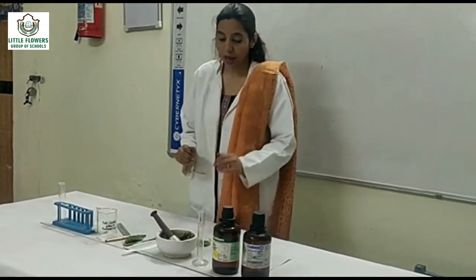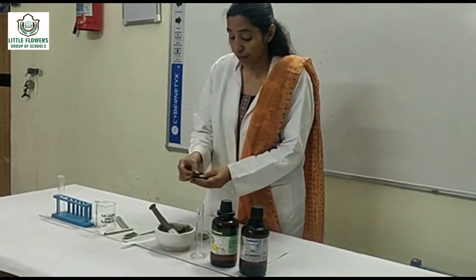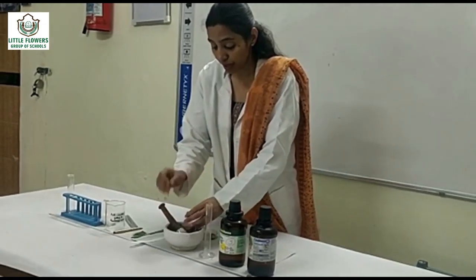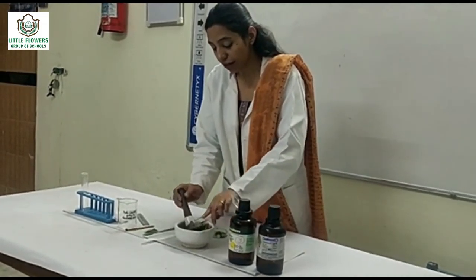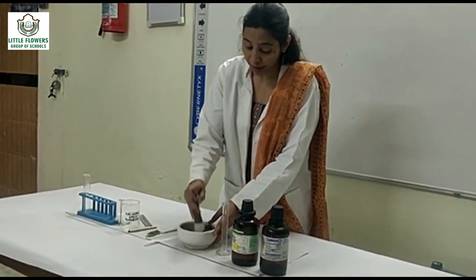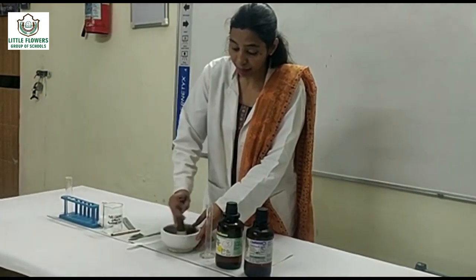Now first of all we have to take some leaves in the mortar and pestle and add 5 ml of acetone in it. Grind the pestle and make a paste.